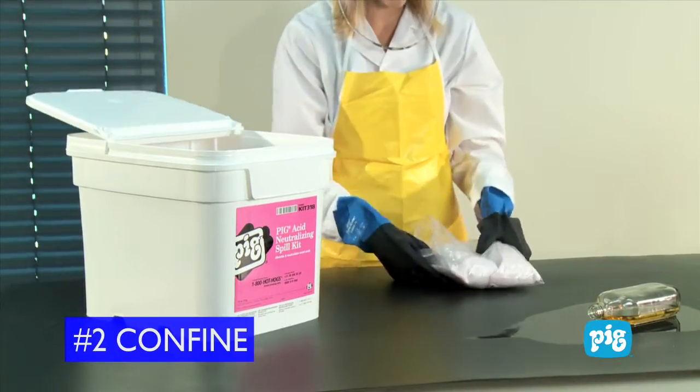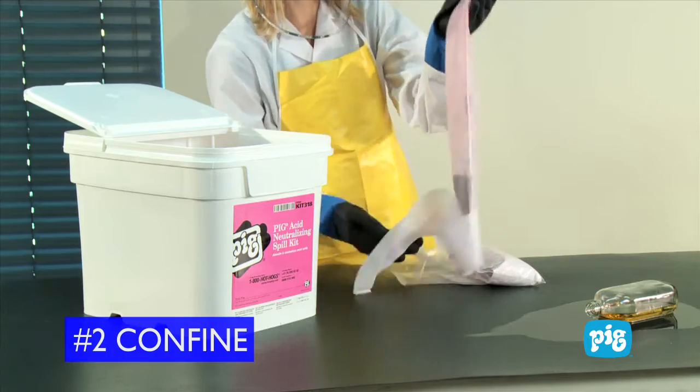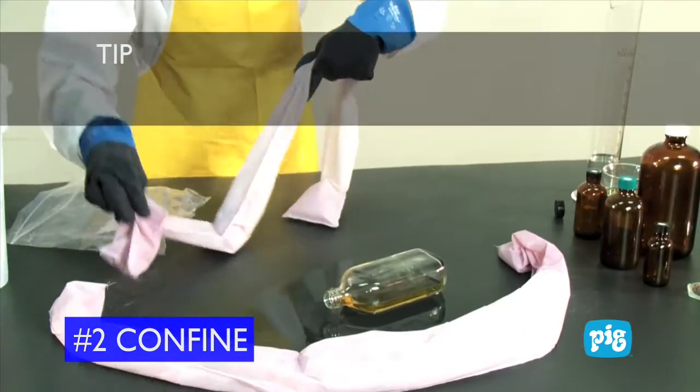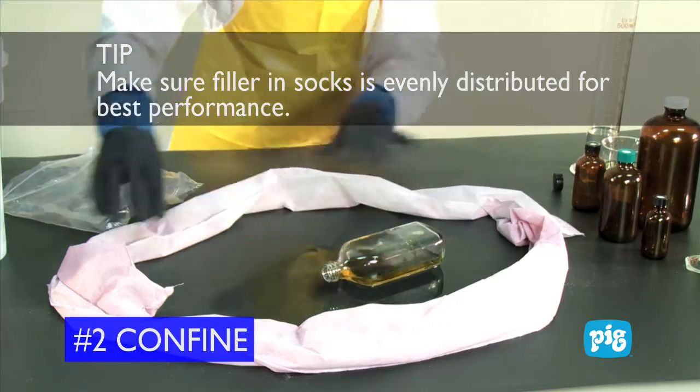Step 2: Contain the spill. Surround the spill with absorbent socks to stop it from spreading. Another tip: make sure the filler in the socks is evenly distributed for the best performance.